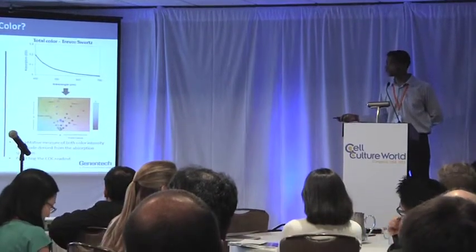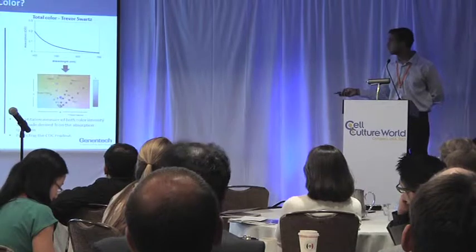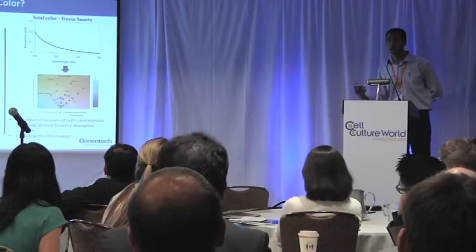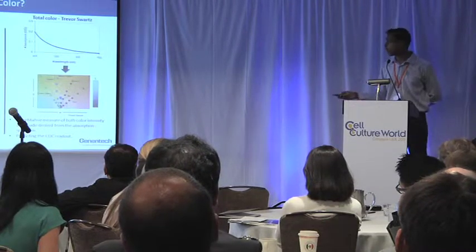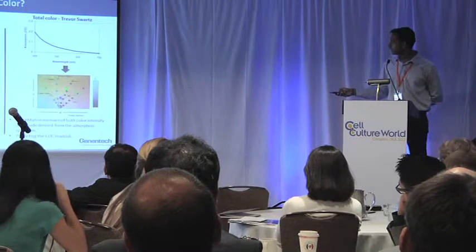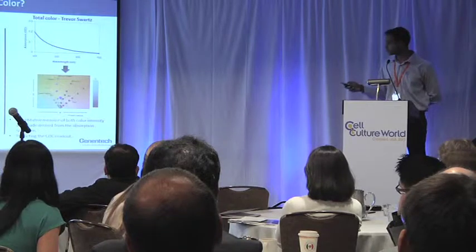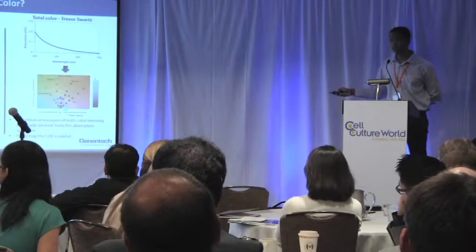The LAB scale consists of a three-dimensional space, which I've represented here as L on the third axis. L stands for luminosity, and it basically gives you an idea of how intense the color is. Whereas the A and B form a plane of all the colors that the human eye perceives. And in this particular plot, we've plotted out the COC standards that we showed in the previous plot as red, brown, brown yellow, yellow, and green yellow.